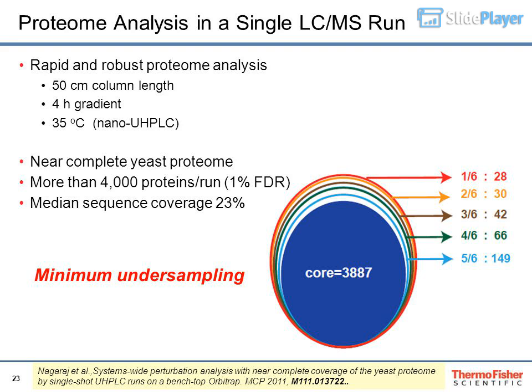D. The conjoined circles represent the frequency of identification of proteins in the 6 runs. Proteins identified in all 6 runs are designated as core proteome in the innermost circle. Single runs of fast-prepared and digested lysates. Proxeon Easy-nLC 1000, use of long columns with linear velocity of 250 nl per minute, in the temperature range of 35 °C.